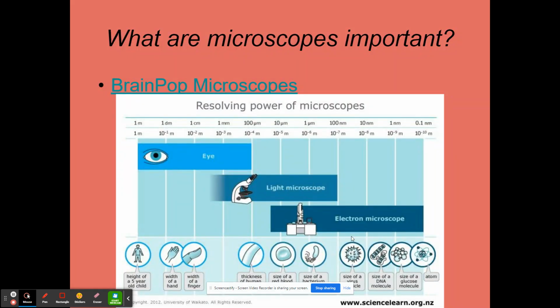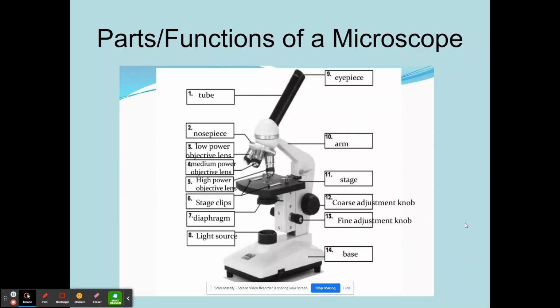So please feel free, you can see the value of this. You can see with the naked eye, the light microscope, and of course, it magnifies so much more with the electron microscope. Up until that point, that's day one. This is going to be day two. We're actually going to be doing more application, and we're going to show you the microscopes. We're going to have you touch and use them in day two.